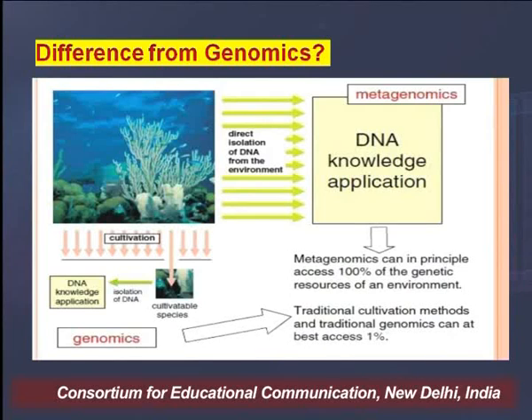But when I am not culturing them, I am taking out all the DNA from one environment, again the rhizosphere. What I would do is isolate all the DNA from the environment, then amplify all this DNA and assign it taxonomically, and then I would know which organisms are present just on the basis of sequences, meaning we don't go for culturing.